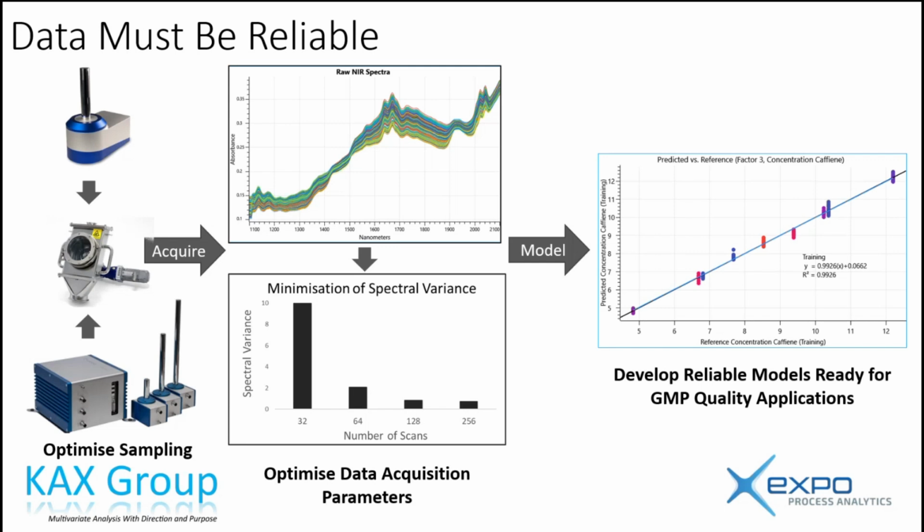And then the theory of sampling, of which I have been flogged so many times over the years because I wrote a textbook with Kim Esbensen, and all I ever heard was theory of sampling, total analytical error, total sampling error. So I'm one of those disciples. And the thing is, I've seen a lot of examples where this spread here is quite wide. And I can tell you 99% of the time it's sampling variability.